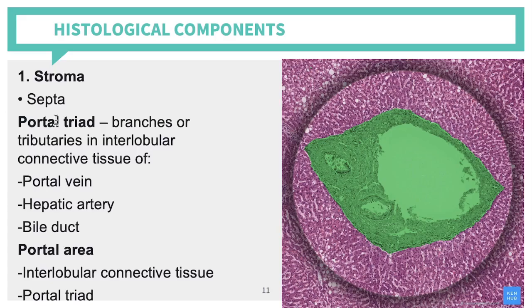Your portal vein has a bigger lumen and a thin wall. Your hepatic artery has a thicker wall compared to the portal vein but a smaller diameter. Your bile duct is lined by simple cuboidal epithelium — if you see simple cuboidal cells, that is your bile duct. So the components of the portal triad are: portal vein, hepatic artery, and bile duct.